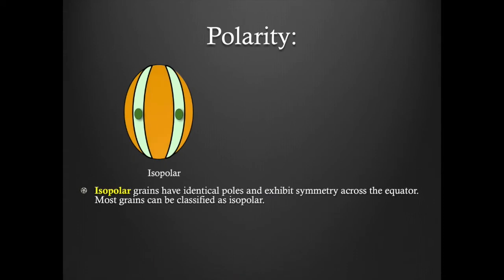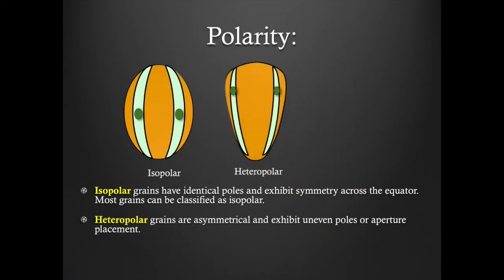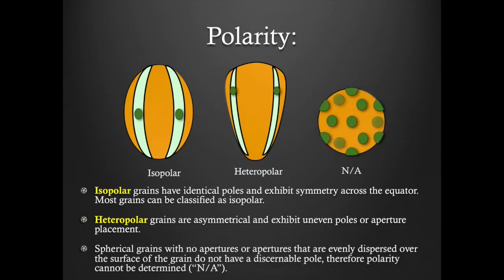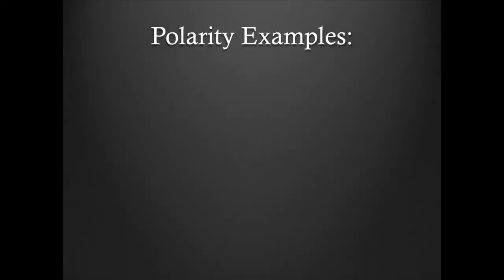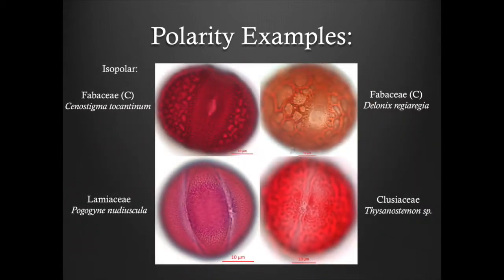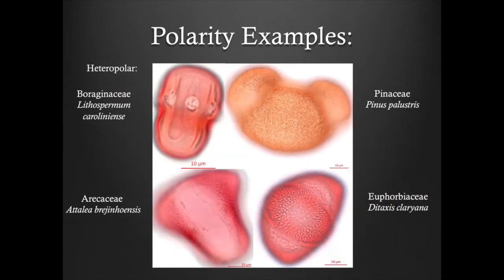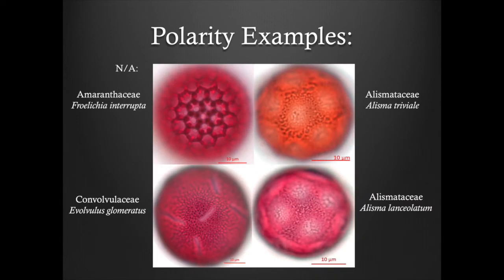Here you can see an example of a colporate polar view. Polarity: isopolar grains have identical poles and exhibit symmetry across the equator; most grains can be classified as isopolar. Heteropolar grains are asymmetrical and exhibit uneven poles or uneven aperture placement. Spherical grains with no apertures, or apertures that are evenly dispersed over the surface of the grain, do not have a discernible pole; therefore polarity cannot be determined. Here are a few examples of isopolar grains, a few examples of heteropolar grains, and some examples of grains where the polarity cannot be determined.